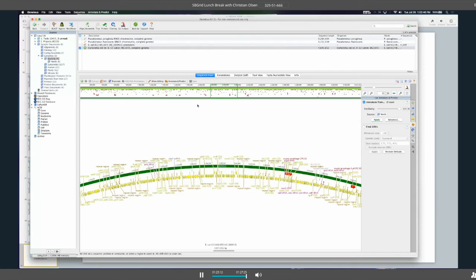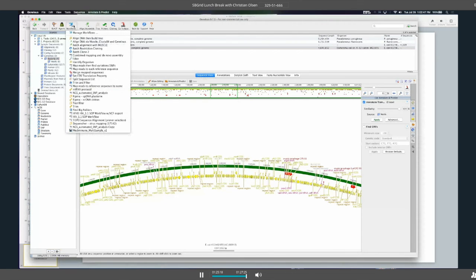Great, thank you. One other question: the workflows are really powerful, and their portability and shareability is fantastic. That would seem to lend itself to some sort of community resource, a hub of sorts where people could deposit, extract and modify workflows. Is there anything like that in the mix or on the drawing board?